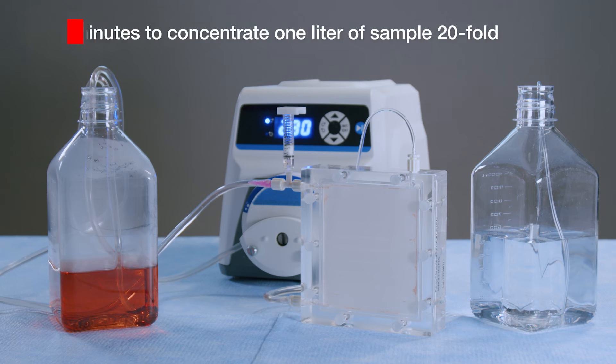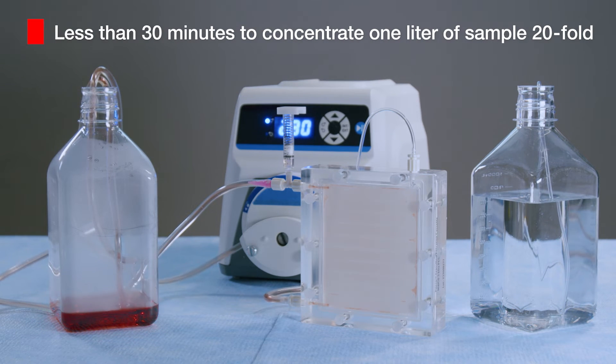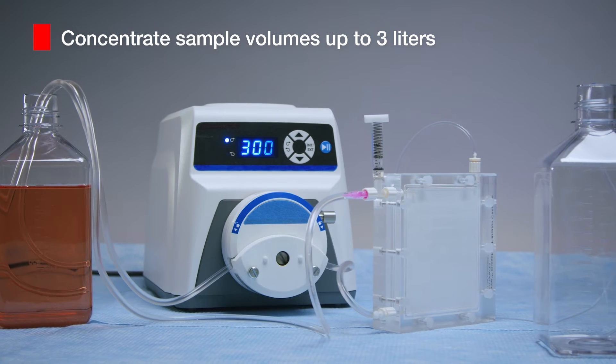The Pierce CrossFlow Filtration cassette takes less than 30 minutes to concentrate one liter of sample 20-fold. A single device can concentrate sample volumes up to 3 liters.